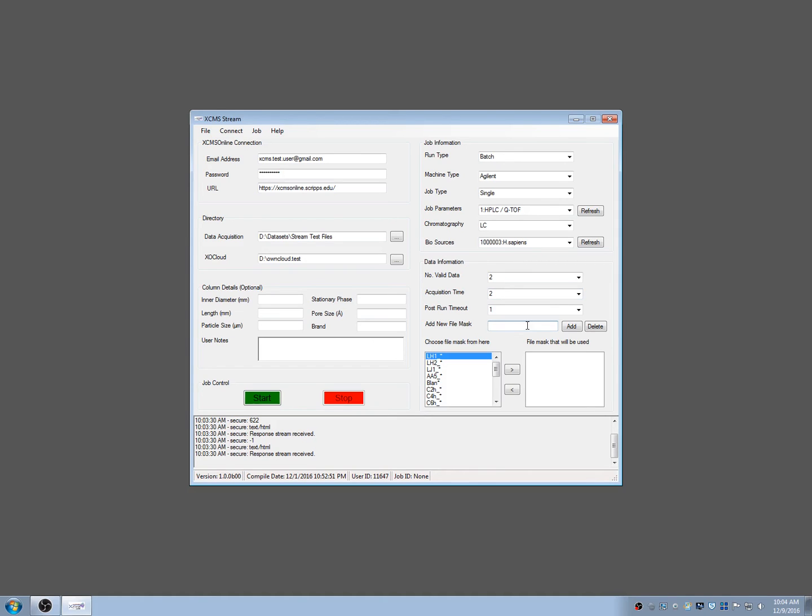To enter a new 4-character mask, click Add to place it in the reserve list, then click the right arrow to move it to the current job pane. If you are running in Batch Mode, the files must be renamed to match the masks provided. See the documentation for more details.